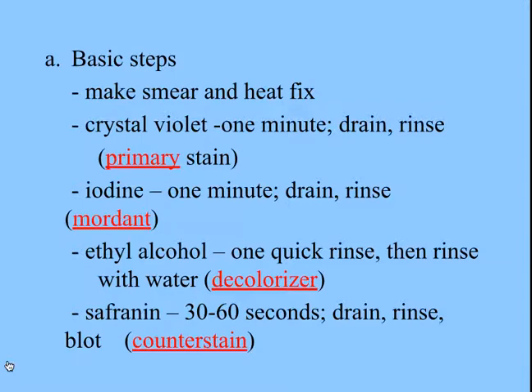Something new is iodine. Iodine acts as a mordant, which actually binds to the crystal violet and will keep it inside the cell wall. And you let that set on the smear for a minute. Crystal violet and iodine, make sure when you put them on, they haven't weakened and they're not too light. If they are, just let me know and we'll replace it.